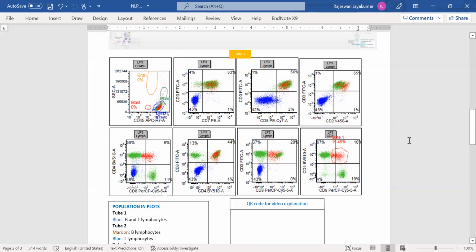And they express nice CD3. There is really nothing different in the intensity of expression of any other T cell markers in these cells, except that they are CD4 positive and are trending towards being both CD4 and CD8 positive. So we have a population of CD4, CD8 double positive T cells in the background. So what is the utility of this population?